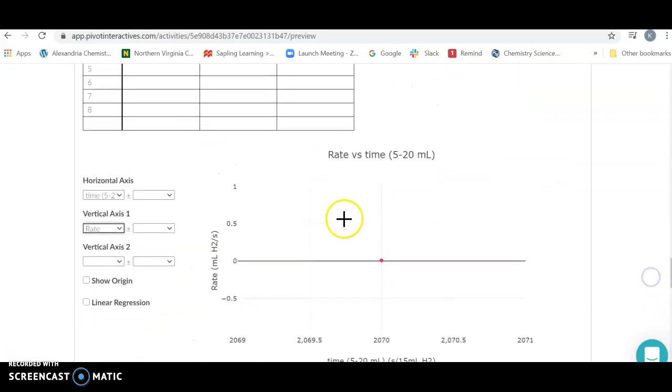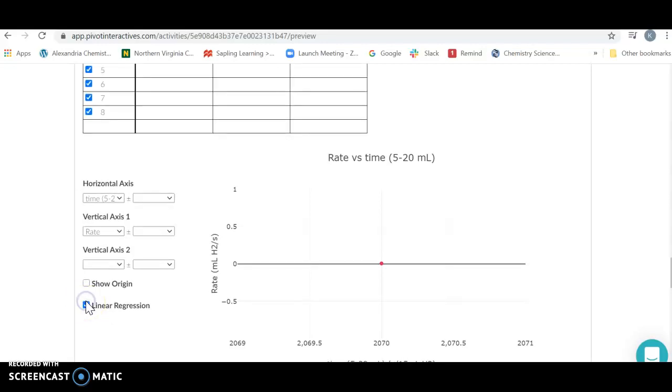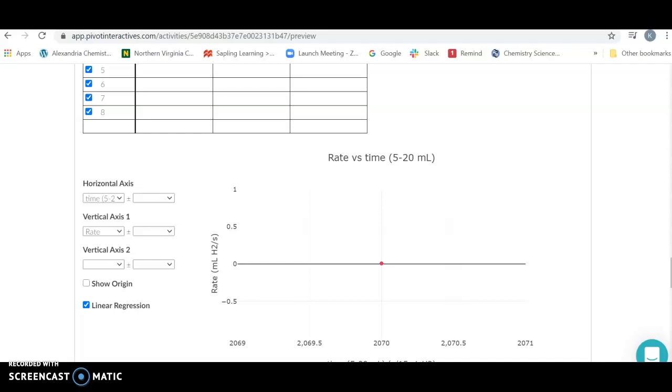It never does any harm at the end to put in a regression. I can't do one because I only have one data point, but as you get more data points you can click this button and it's going to give you a nice fit for this data. So your job: What's going to happen to the rate of this reaction as you increase the concentration of the HCl?